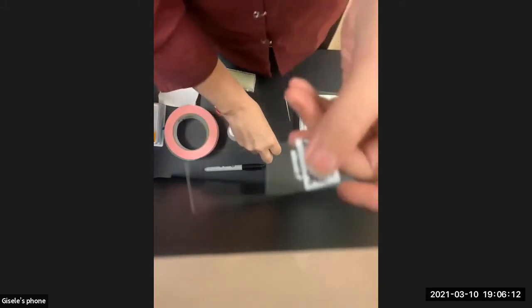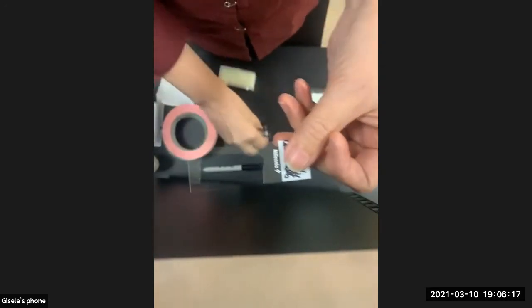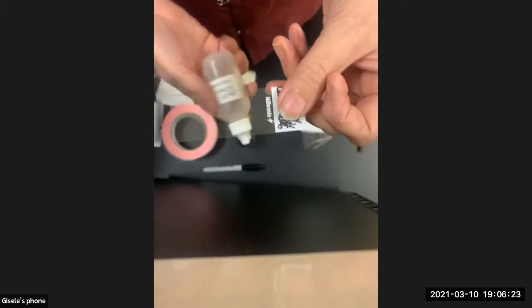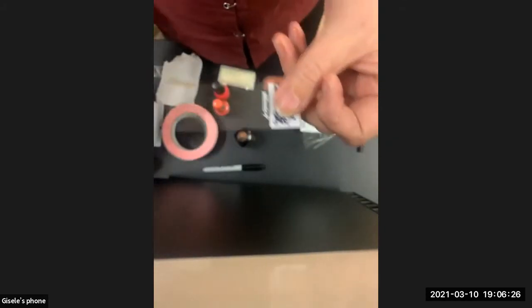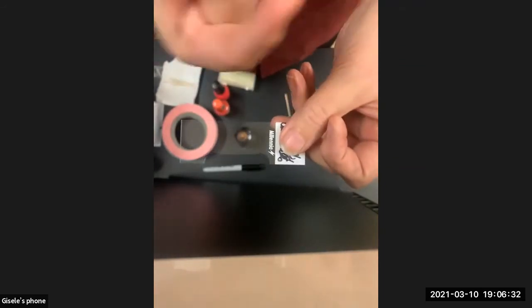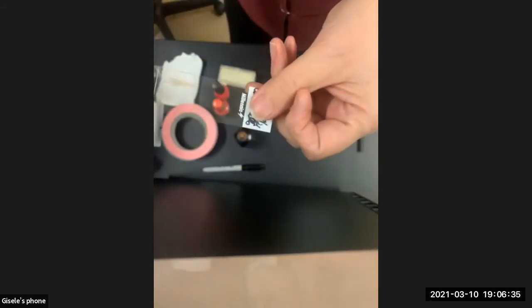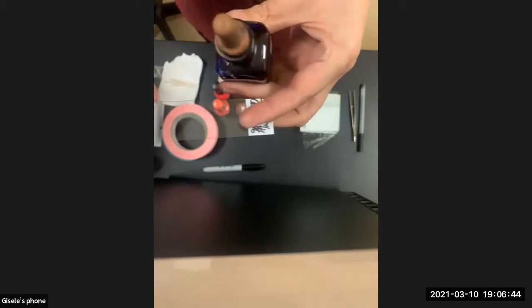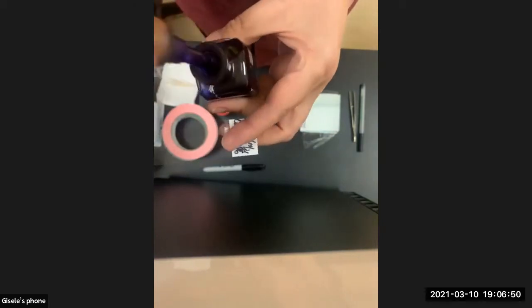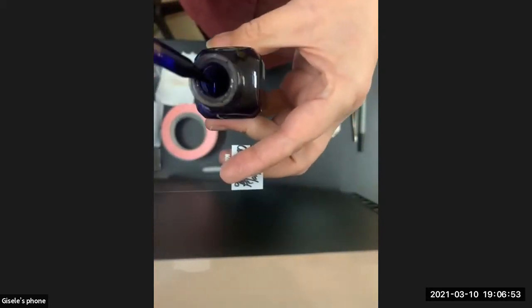The next thing that you need to do, don't wave it around. Like if I actually had something, I won't wave it around so much. The next thing you're going to have to do is add some liquid, because the optics just work better. And in your case, you're going to have some fluids like PBS, which is just saline buffer, in little Eppendorfs, so little test tubes that come with your kit. I happen to just have a whole lot of dye here. One of your test tubes gives you some methylene blue. You're going to take a little transfer pipette that you have, or in the case here, I'm going to take some straight out of the bottle.